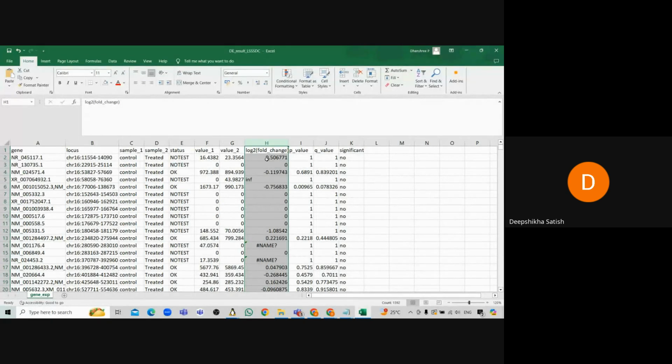You can change the cutoff as per your choice. Let us consider you are interested in some gene, ABC gene, but that gene has an expression value of 0.8, and if you apply a filter of 1, you are missing the information of the gene, but you don't want to miss that information because this is your key gene. At that time you can reduce the cutoff, like make it 0.8. Or maybe whenever you apply a cutoff of 1 for upregulated and downregulated, you get thousands of genes, and with those thousands of genes, you are not able to plot a graph or check the interaction. In that case you can simply increase the cutoff. You can take those values which are highly expressed or highly suppressed. So my point is that the cutoff is flexible. The standard is 1, but you can change it as per your choice.